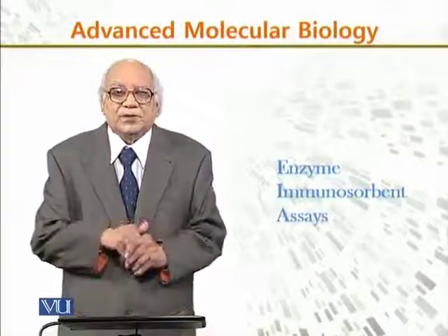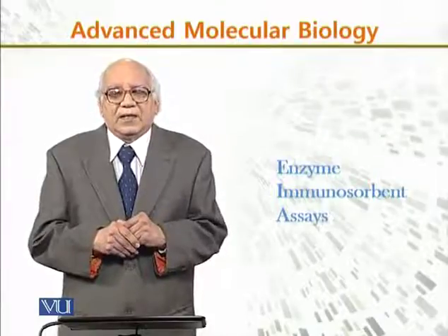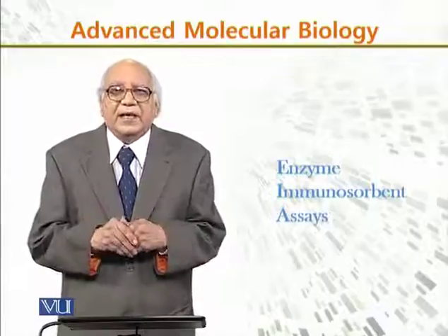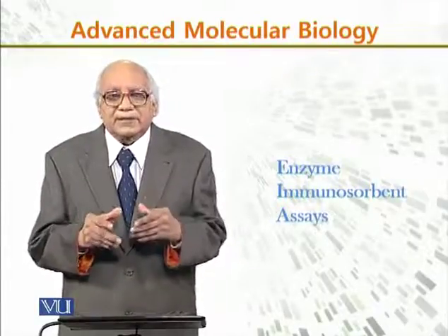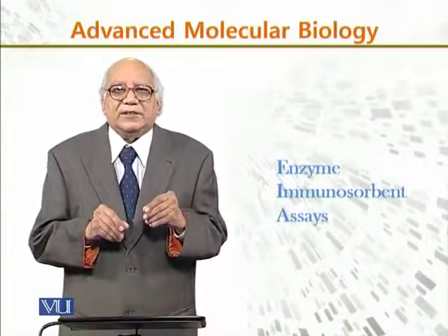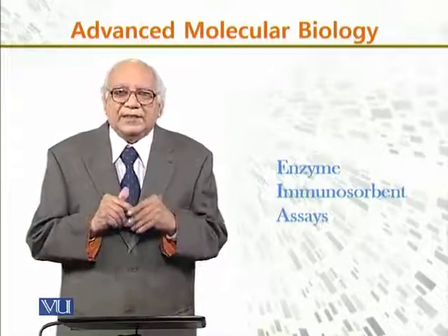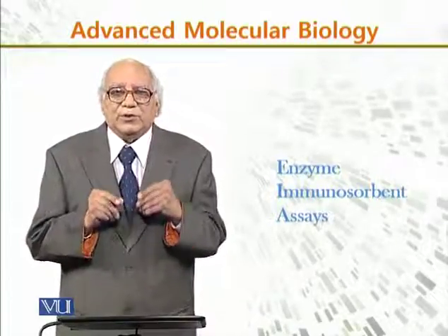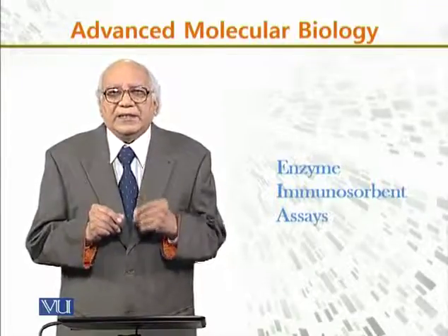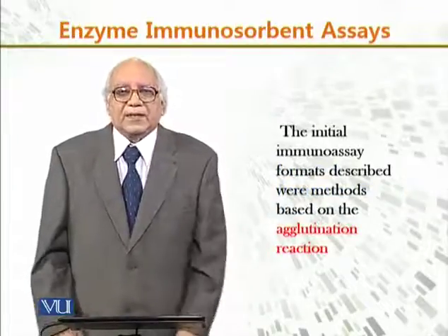Now, since we are discussing the various methods of antibody assays, the antibody estimation, in this module I will discuss another important method, which is called the enzyme immunosorbent assay, and how we can make an assay of antibody by this method.